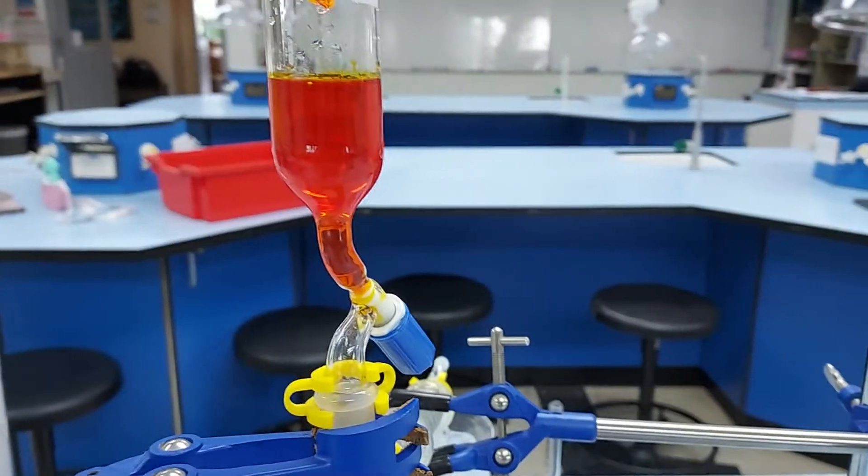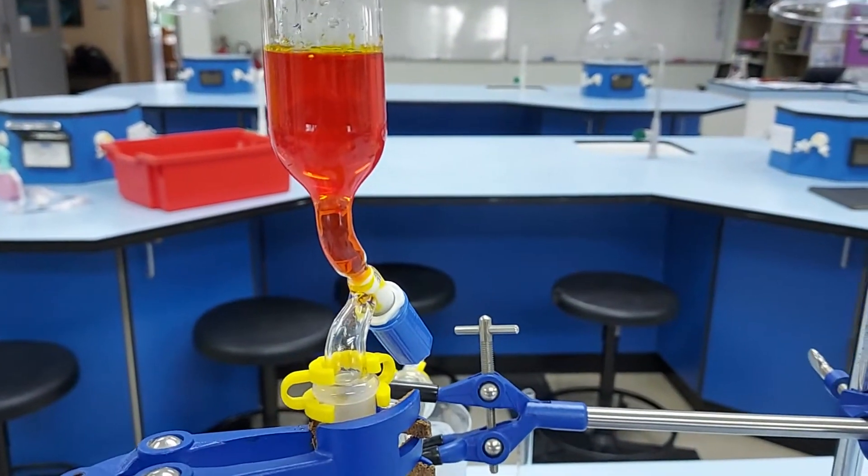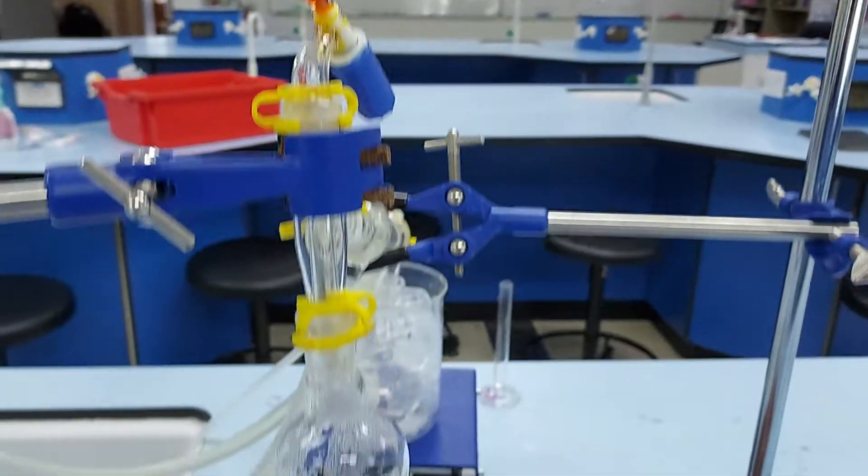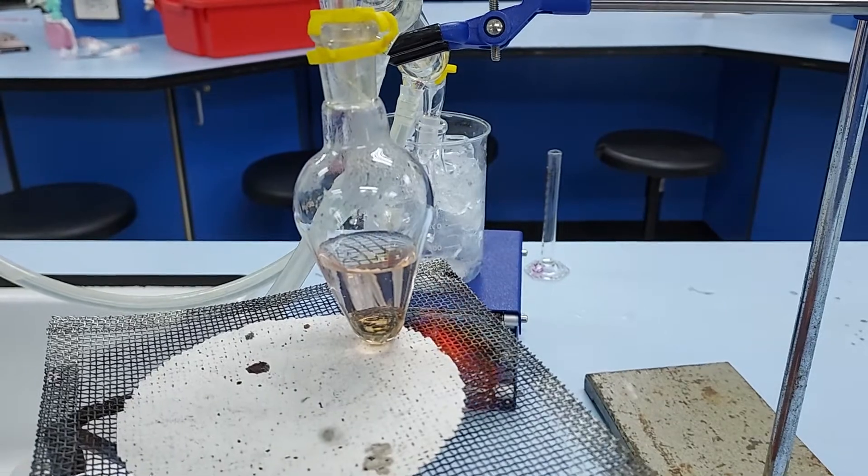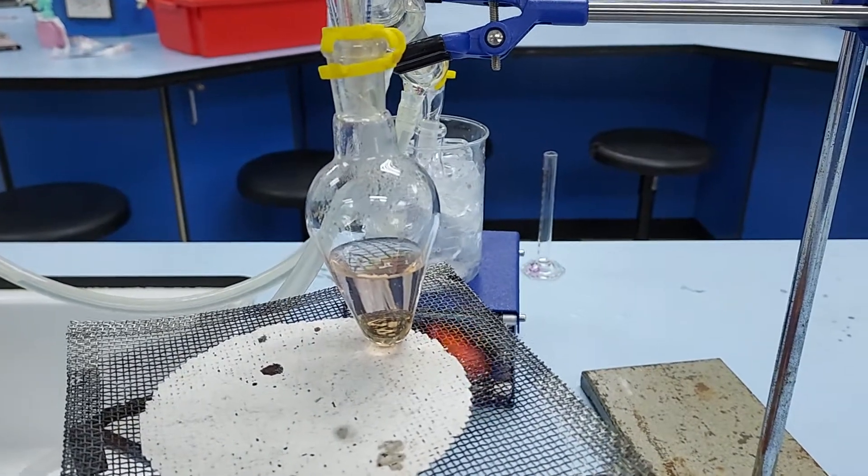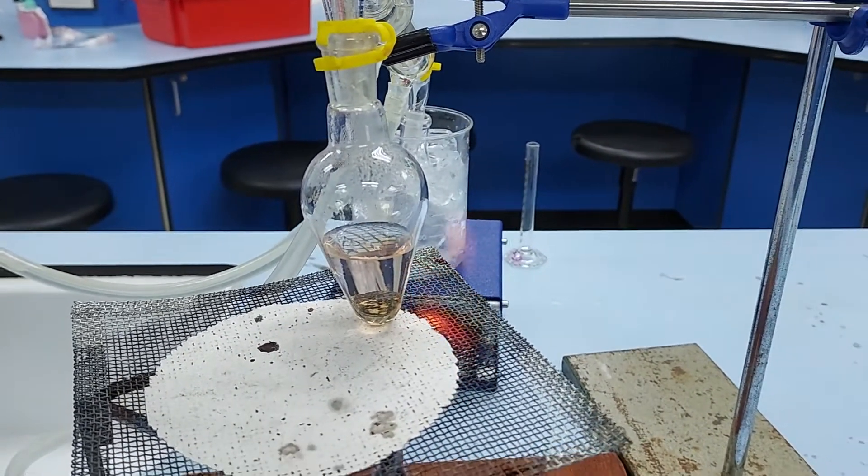In the funnel we've got ethanol and sodium dichromate, and in the pear-shaped flask we've got concentrated sulphuric acid which is mixed with a little bit of water.